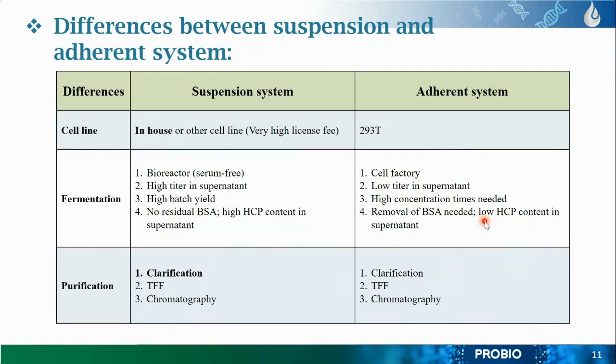And the high batch yield is in the suspension and lower in the adherent. And there's no residual BSA, so it's serum free. So of course, there are no BSA impurities, so you don't have to do an extra removal step to take it out. But it comes with higher HCP content in the supernatant.